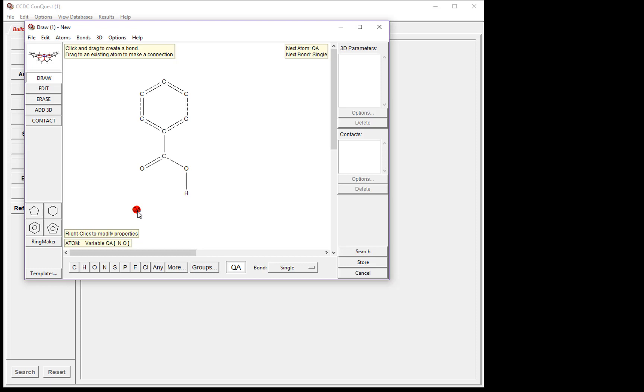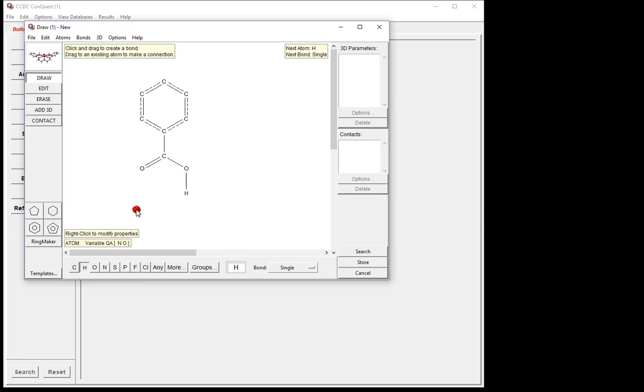Now we need to add the hydrogen to our hydrogen bond donor. Select hydrogen from the atom list, click QA, and drag to create the hydrogen. Now we have both of our fragments drawn.